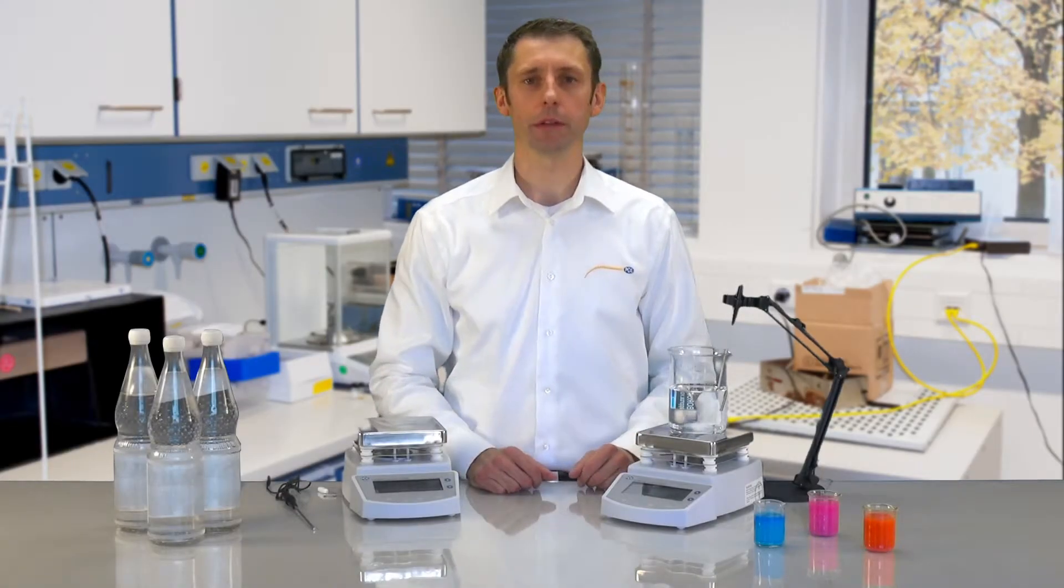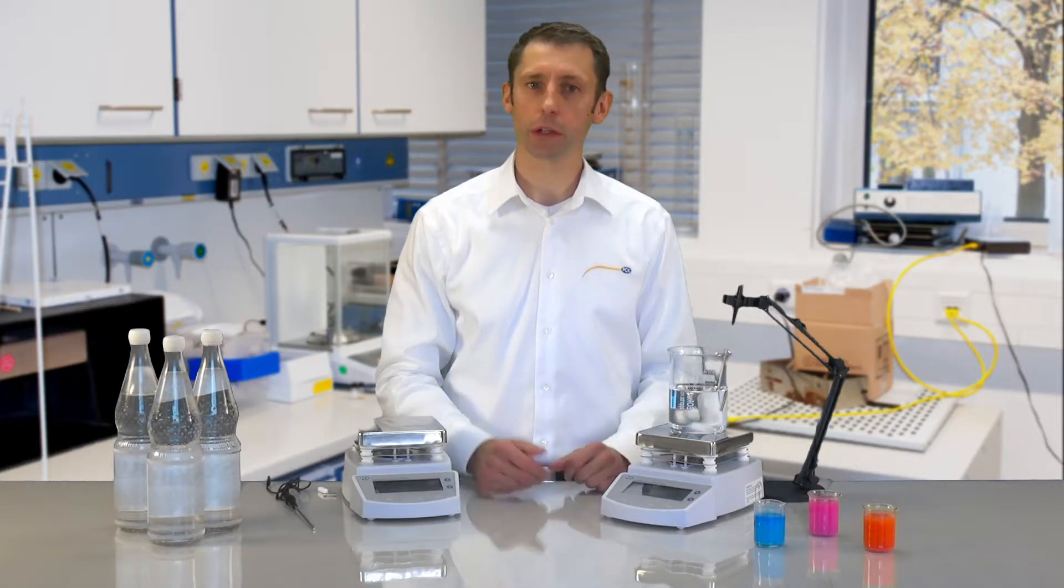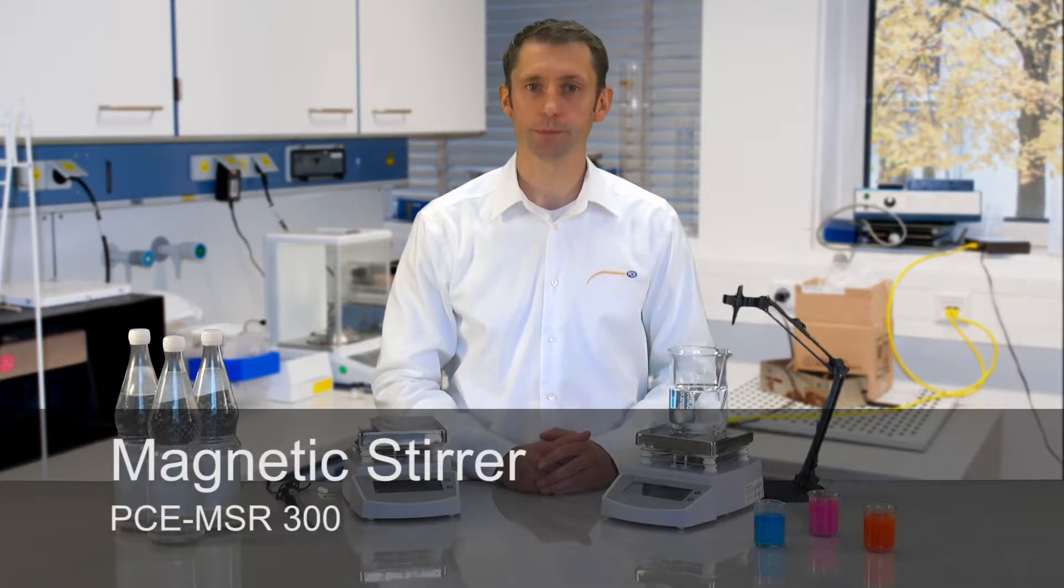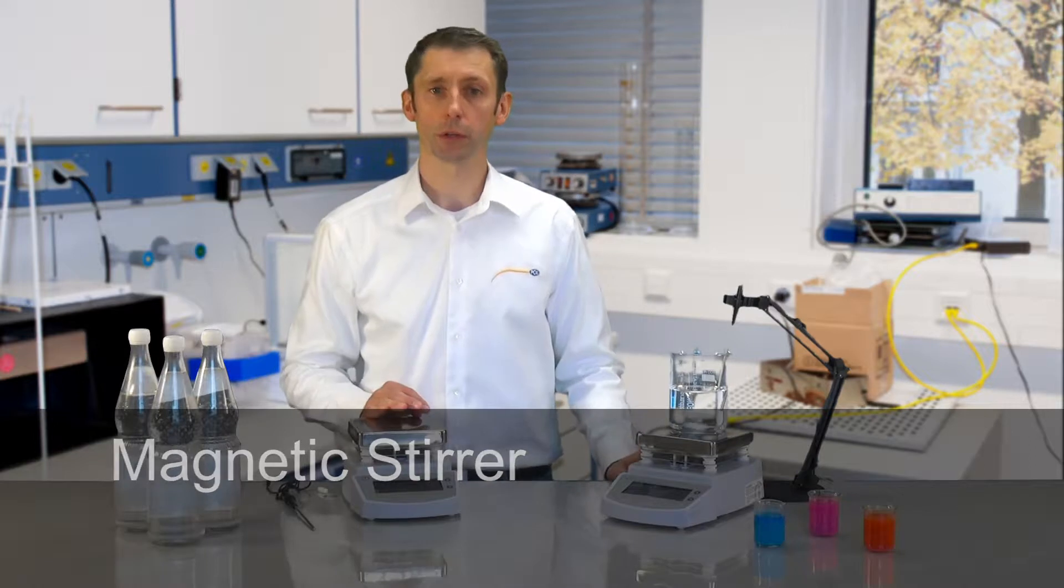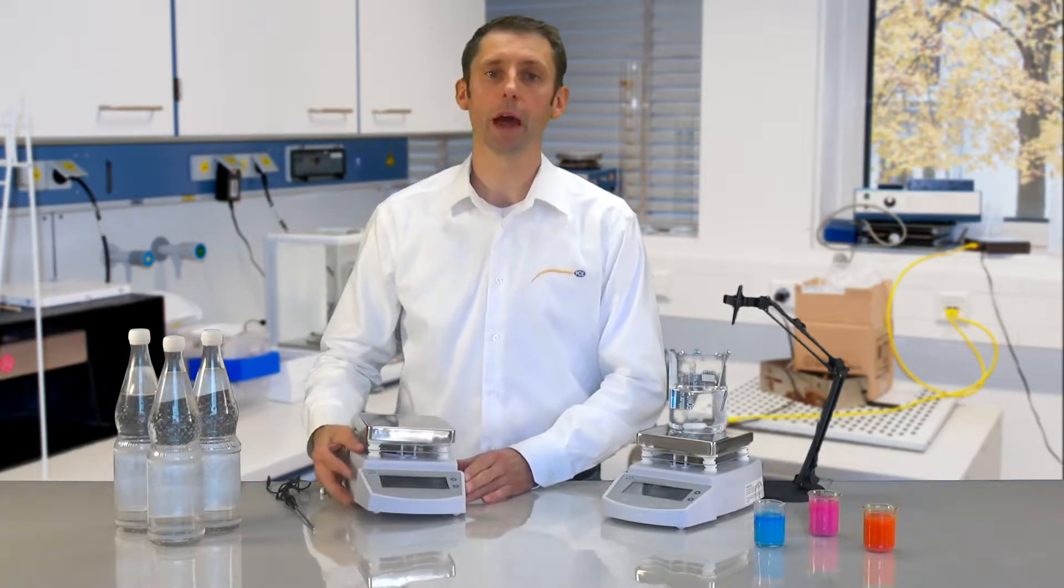A very warm welcome to PC Instruments. My name is Lukas Ludwig and today I would like to present to you the Magnetic Stirrer PC MSR 300. The Magnetic Stirrer PC MSR 300 is a motor-driven magnetic stirrer with a built-in heating plate.